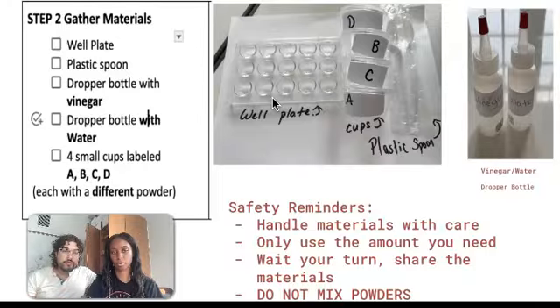And you're sharing. So go ahead and wait your turn. Share the materials as needed. And finally, we want to keep everything nice and orderly. You don't want to mess up your experiment. So do not mix any of these powders or your spoons. That's why they are labeled.